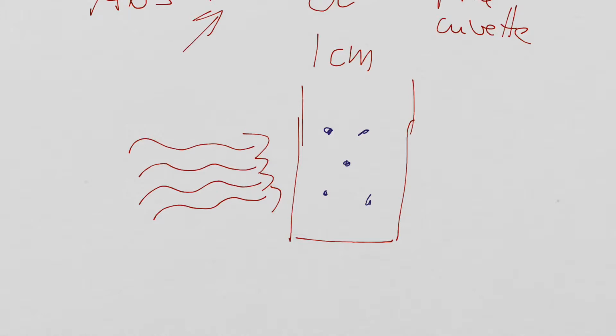These dots, the substance absorbs the light. And let's say we get 2 out. So we get 50% out, as we had before. Yeah? Let's do the same thing.